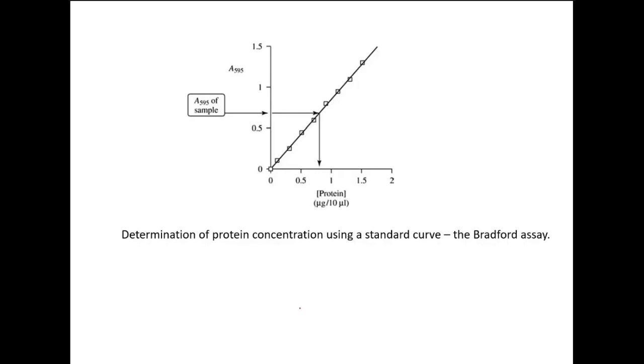The procedure is a very popular one, called the Bradford method or Bradford assay. One of the highly cited papers in science is the Bradford assay. Those who are working on protein must quote this paper, the Bradford 1976 paper. For the construction of the protein standard graph, UV visible spectroscopy is of great use, without which it cannot be possible. So at 595 nanometer, you have to prepare BSA at different concentrations, add an equal volume of Bradford reagent, that is called CBB G250, and take absorbance at 595 nanometer.